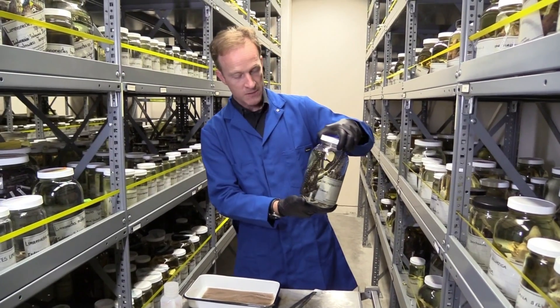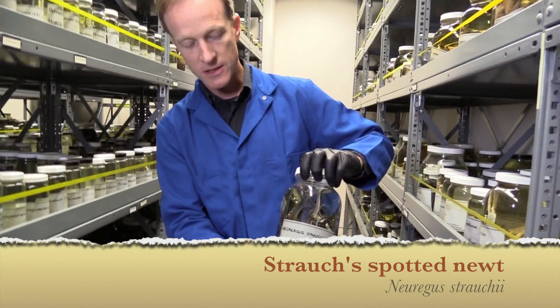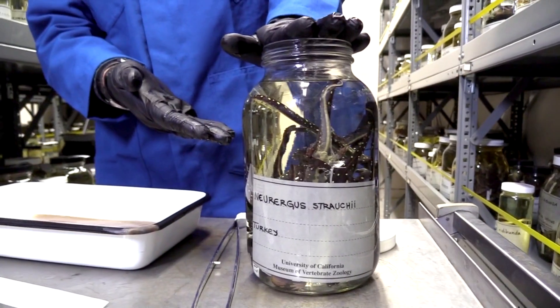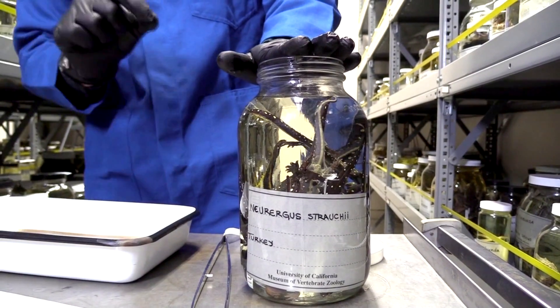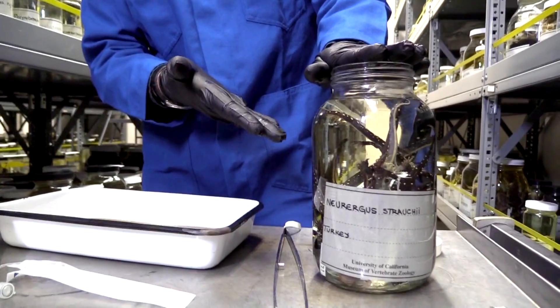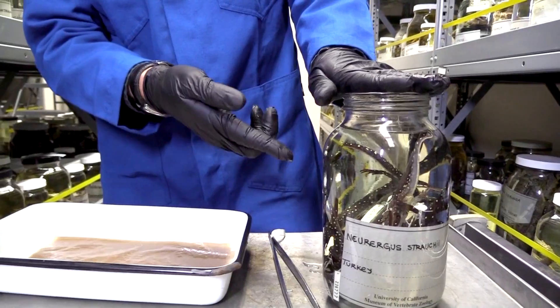I've got a jar of animals here — these are specimens, salamanders from the family Salamandridae, collected in Turkey. We're going to search to see whether these animals are infected with a fungal pathogen by taking one of the animals out and swabbing the skin. You might be wondering: if we get a positive, how do we know it's from the animal I swabbed and not cross-contamination from the other animals in the jar?